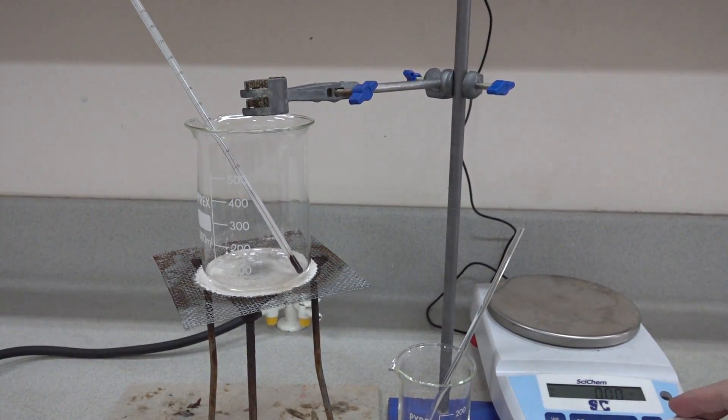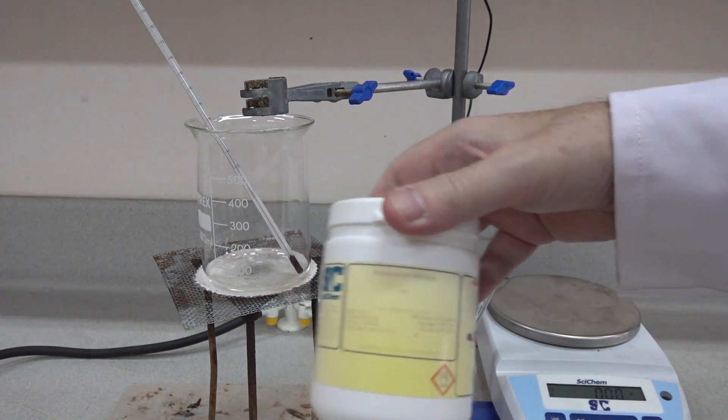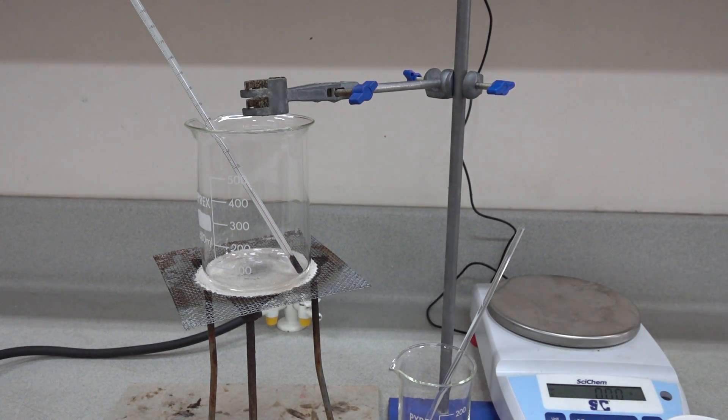This experiment is called investigating the solubility of a solid in water. The solid in question is potassium nitrate and the temperature that we're aiming for is around 40 degrees centigrade.